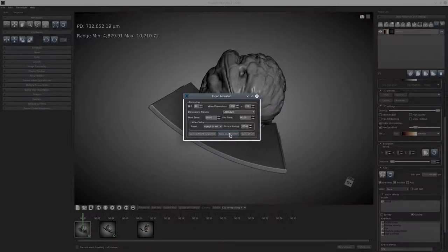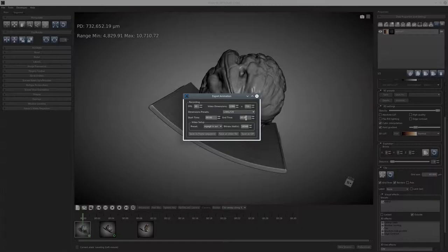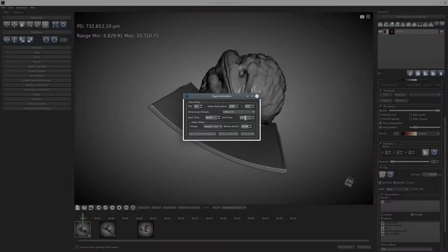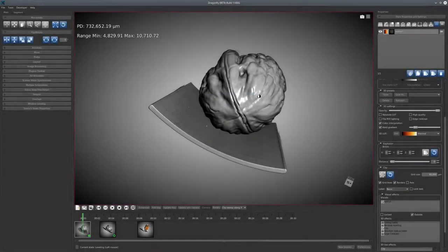Finally, you can either choose to save as a video file, which will use this container, or you can choose to save as a frame sequence, in which case all of the individual frames, 30 frames per second over nine seconds, would all be stored in a file. Those could be later imported into some other 3D tool, some other movie making tool for authoring a movie from those individual frames.